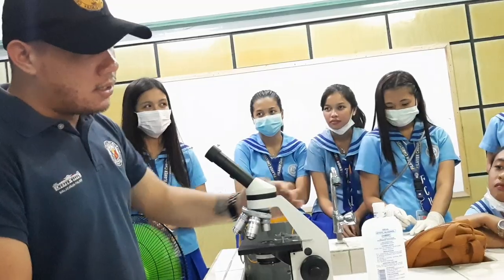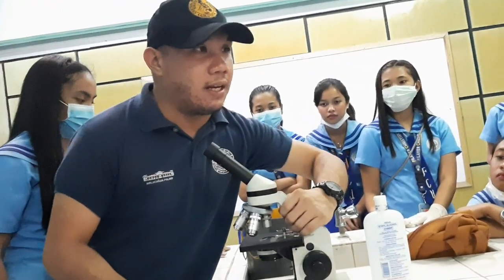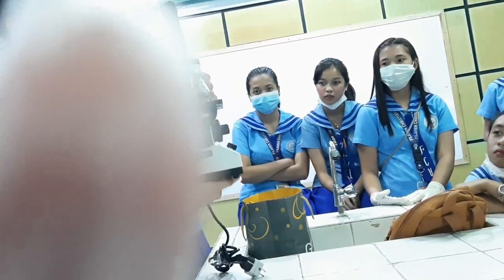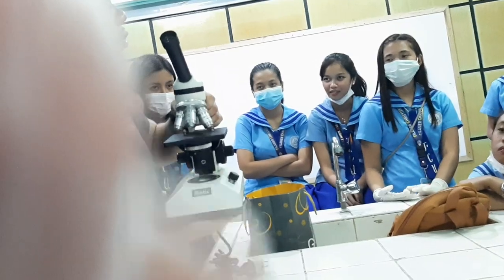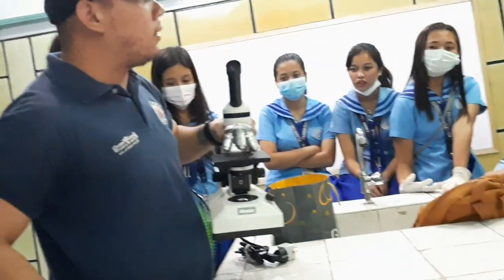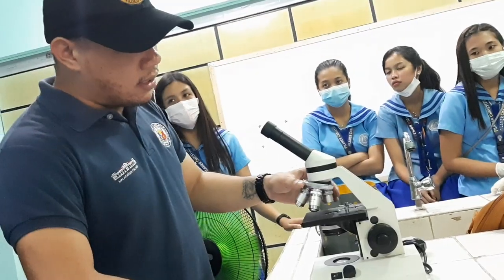Okay? This is the arm of the microscope. So it means that diri ka naga-carry. Okay? But in the same time, dapat ginataga niya sa support sa dalon sa may base niya. Hindi pwede mag-carry nga mo nila. Okay? Dapat may araksang support. Next is this. What's this? Ano yun sila?